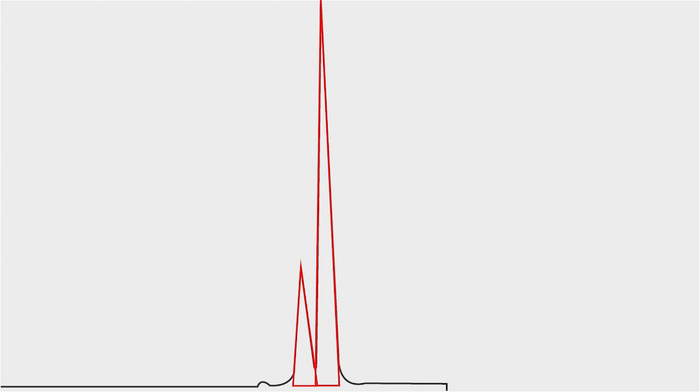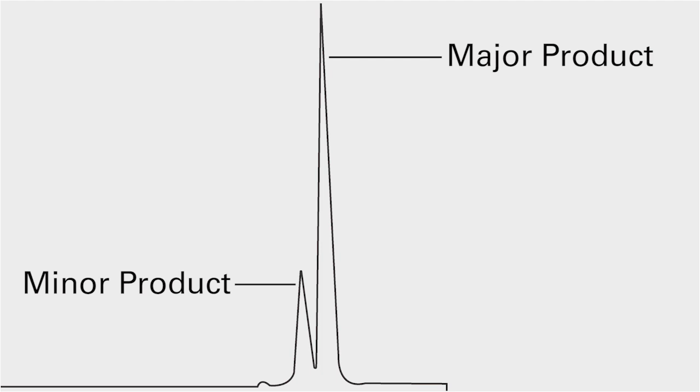In this chromatogram, we have two peaks corresponding to two products. We will use the ratio of the areas to determine the ratio of the two products. The larger peak corresponds to the major product. The smaller peak corresponds to the minor product.